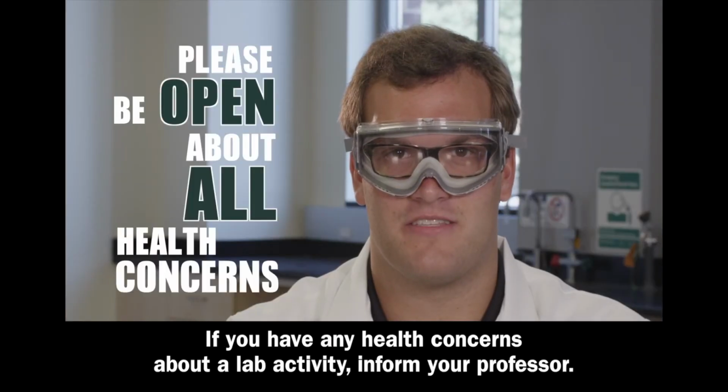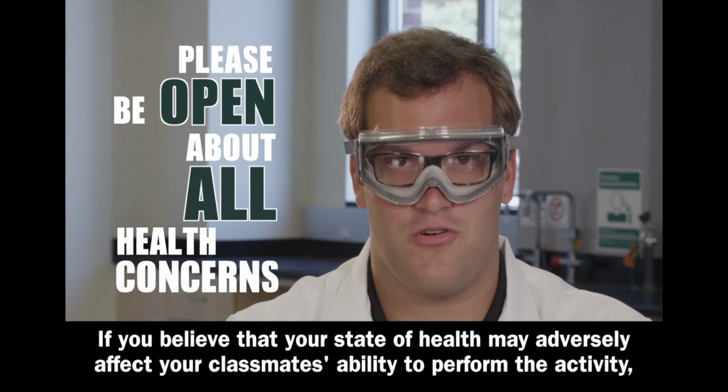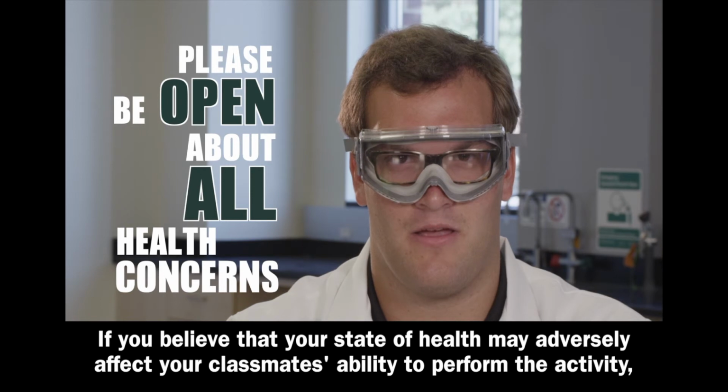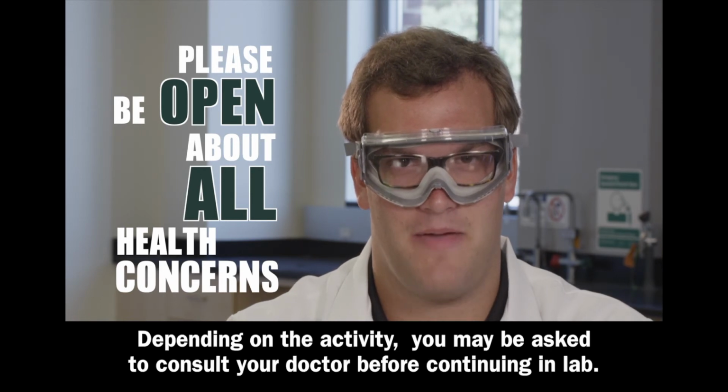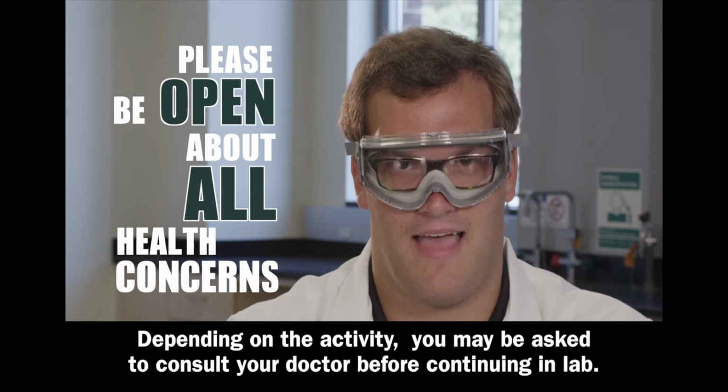If you have any health concerns about a lab activity, inform your professor. If you believe that your state of health may adversely affect your classmates' ability to perform the activity, bring that up with them as well. Depending on the activity, you may be asked to consult your doctor before continuing in lab.